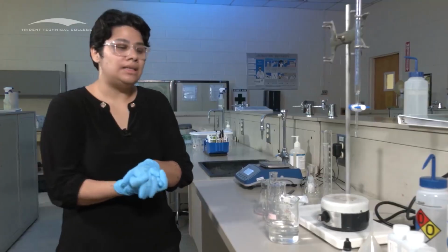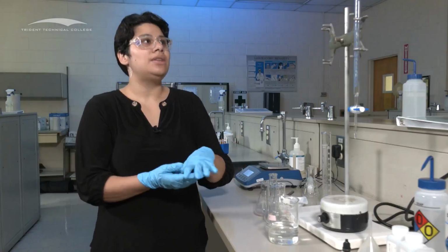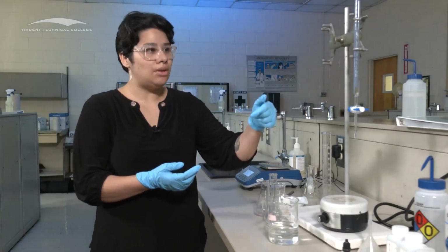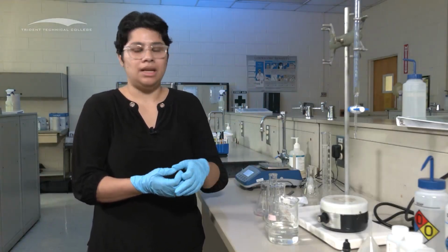Make sure that you wash your hands at all points in time. Make sure that when you're done with the burette, you rinse it with lots and lots of water. If you're having issues with your burette, rinse it with soap, then distilled water very, very well multiple times, and then you can go ahead and use it.